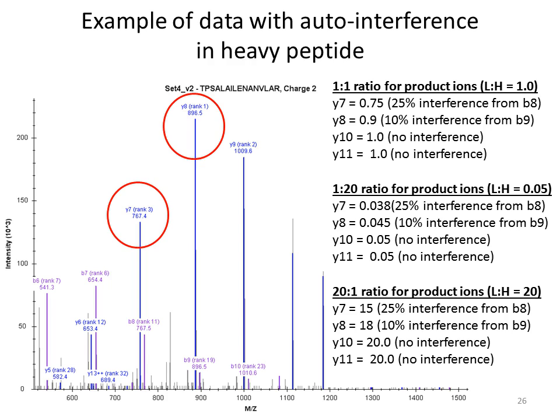So you said that this would happen when there is the B and Y ion being generated which have the exact same mass, right? So even if we were trying to quantify it, because in the previous slide you said that the ratio would remain the same, would it make a difference in the actual quantification of what we're trying to measure?